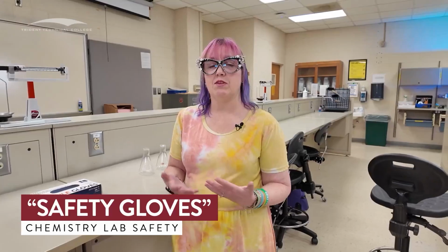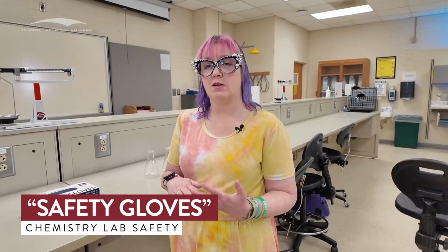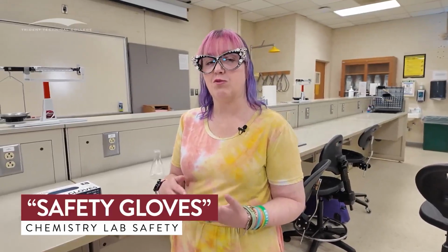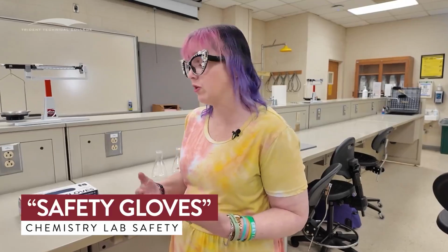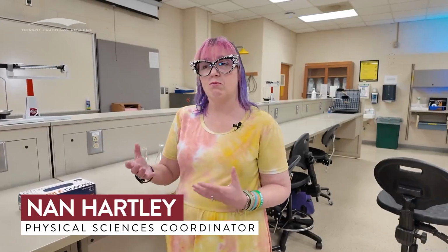So we've got a couple of experiments where we specifically need to be worried about our glove protocols. Those experiments are the solution concentration, the titration standardization, and the titration for the vinegar concentration. For those experiments, it's absolutely necessary that we wear gloves for the entire experiment. For the other experiments, gloves are recommended.